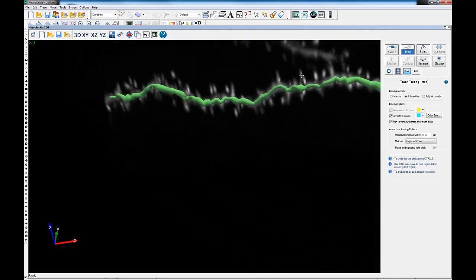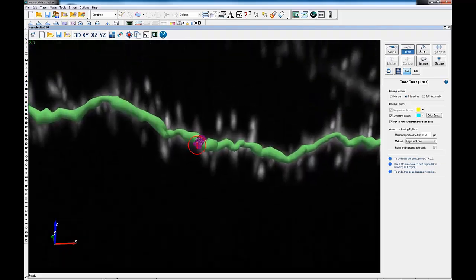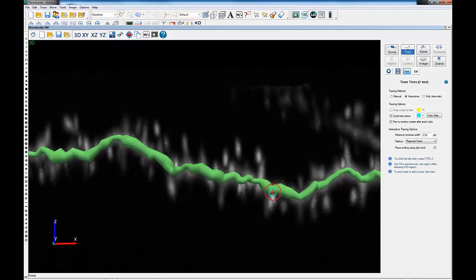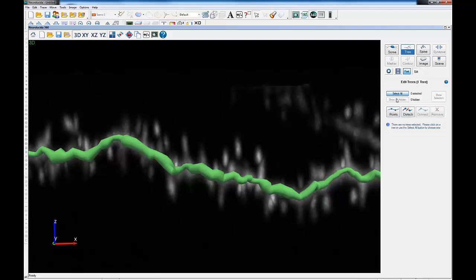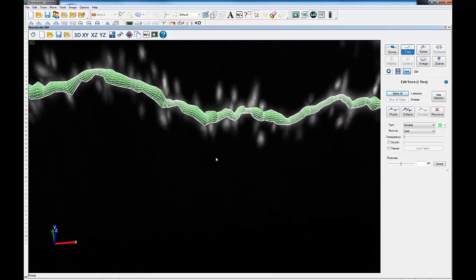And then I like to inspect the dendritic backbone before I detect the spines to make sure that it's really accurate, because when you're imaging at this high resolution, these spines are actually relatively large in comparison to other magnifications, and there are a number of pixels now that make up that spine, and so the algorithms can get sort of, what's that called?